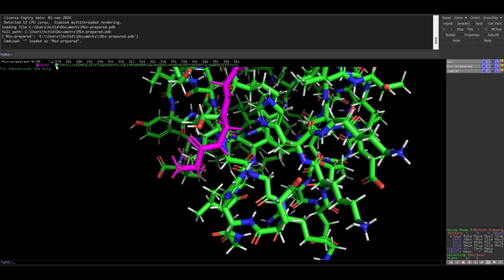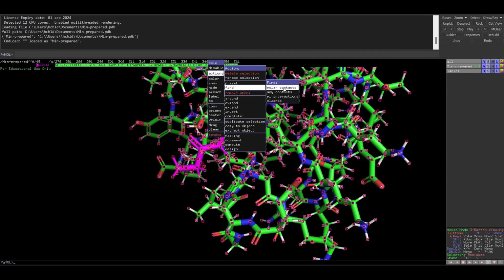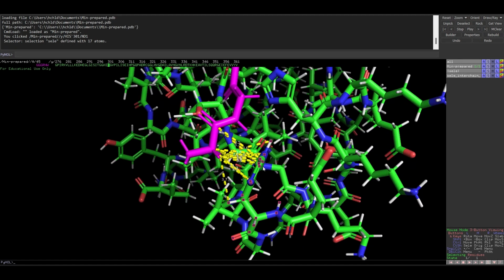And I'm going to highlight this, highlight all the residues on the protein, action, find, once again, any contacts between chains within 4 angstroms. We are once again in contact with H301 for flexibility on this residue. So I'm going to go over the interface and prepare a design where I'll be mutating G45 and flexing H301.